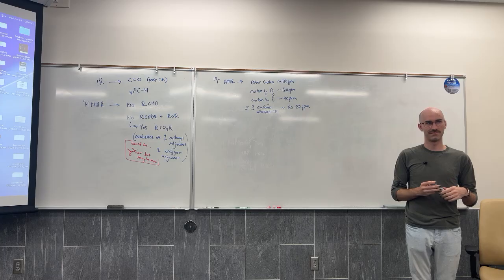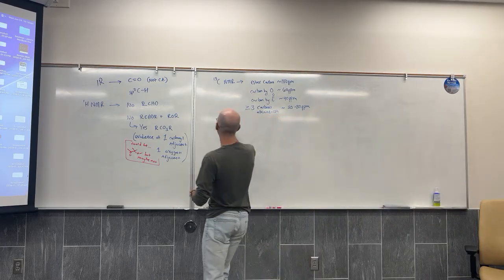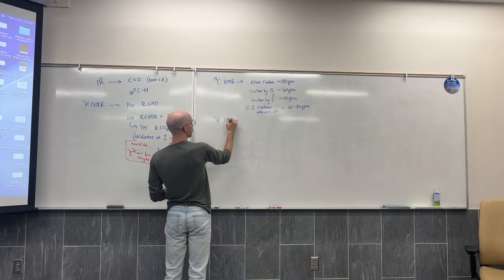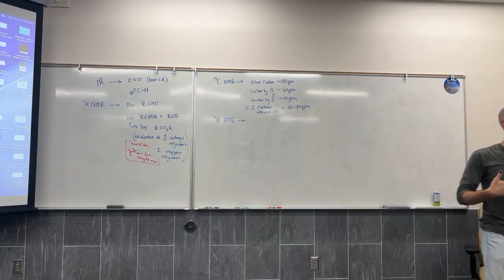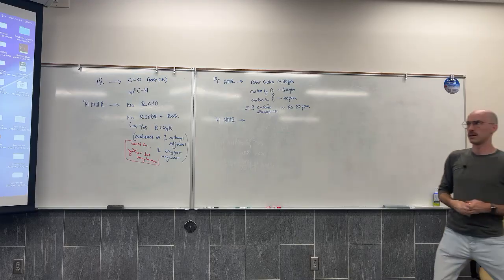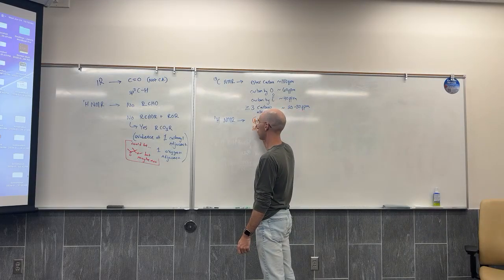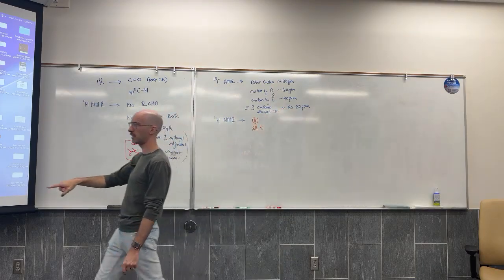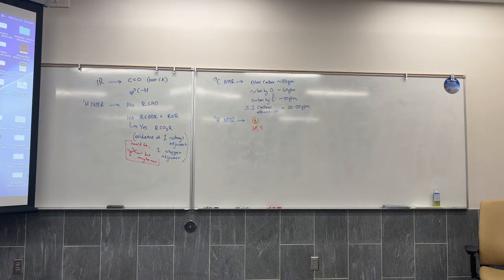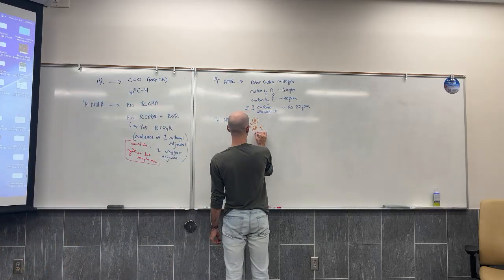Fun. We're loving it. Okay, so I'm going to come back to the proton NMR, and we're going to use the integrations, splitting patterns, and chemical shifts to try and build a structure. All right, I'm going to call our signals A, a 2H triplet. Would you guys all agree? Just past 4 ppm, 2H looks like it's a triplet.